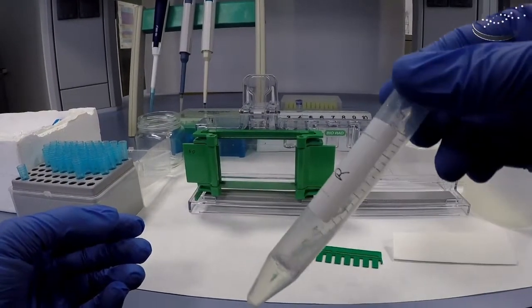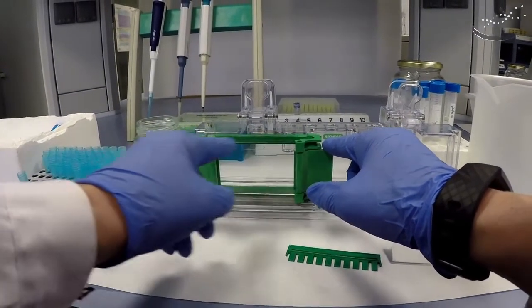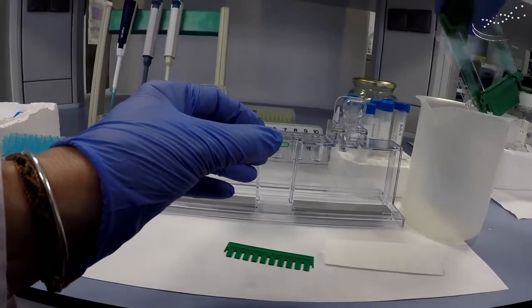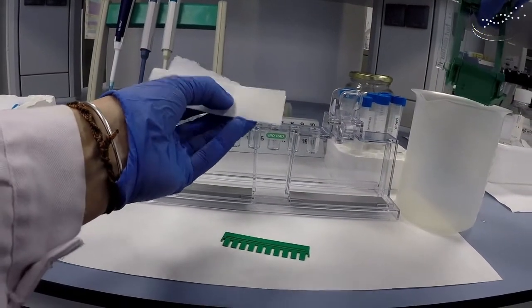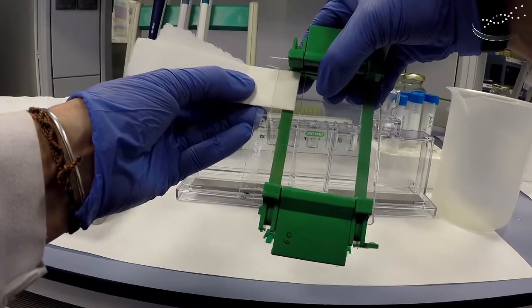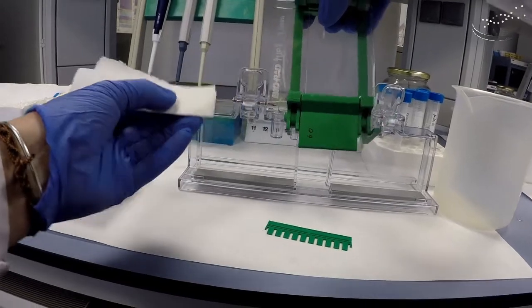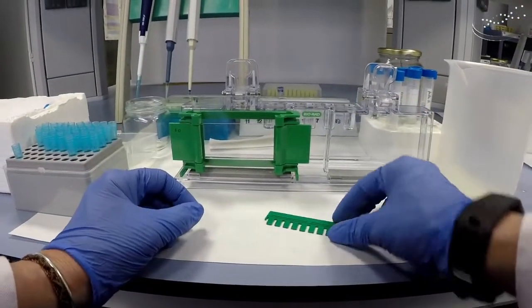After some minutes the resolving gel is perfectly polymerized, so now we're ready to do the stacking. The first step is to remove the water from between the two plates. Remove the assembly from the support by pressing to release the plates, dump the water into a beaker, then take a piece of Whatman paper and dry between the two plates to get rid of the excess water. Use Whatman with straight edges so you can get close to the gel without touching it — slide it down carefully. Capillary action will absorb the water. It doesn't have to be completely dry. Place it back onto the support and you're ready for the stacking gel and comb.